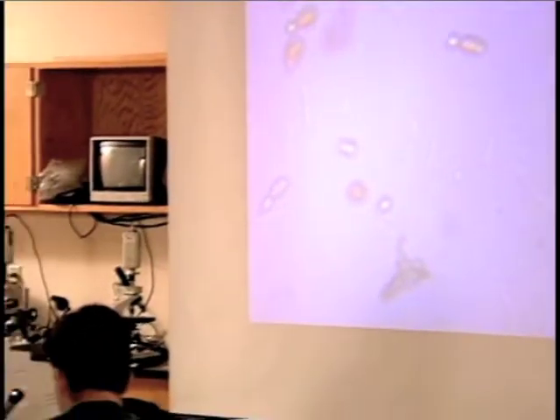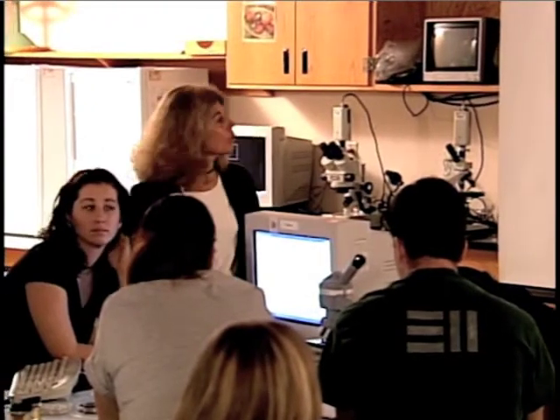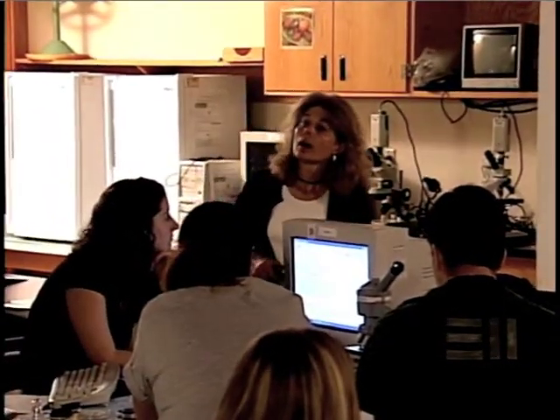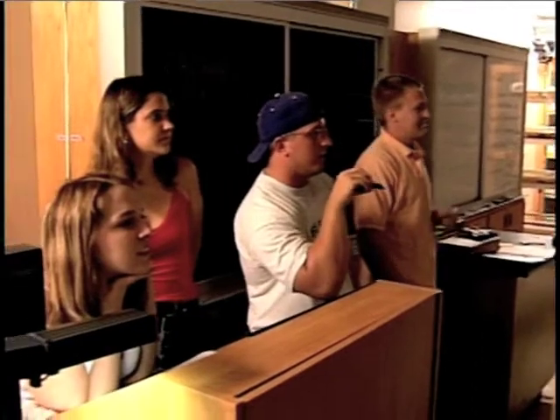Well, what do you think now? Do you think we have an eating going on here? What do you think? You guys think no now? What do you think? The presenters up there. We thought it was. You think what? We thought it was when we were looking at it before. Okay. What made you think that? The little rod things were kind of positioned next to the yeast. Yeah, well, they're kind of dancing up there.